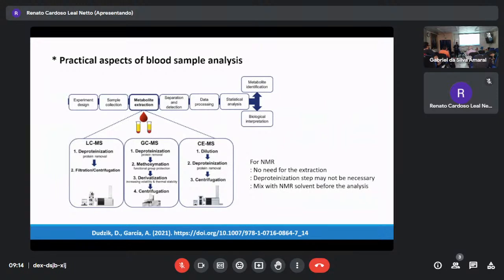That's why the suggestion is, when you are doing a water extract of plants, you have to consider deproteinization because water can extract a lot of protein. So I prefer, when doing plant metabolomics, 50% methanol or 100% methanol, which already precipitates protein. You don't need a special step, as it already includes the deproteinization step. But in LCMS, only one step.